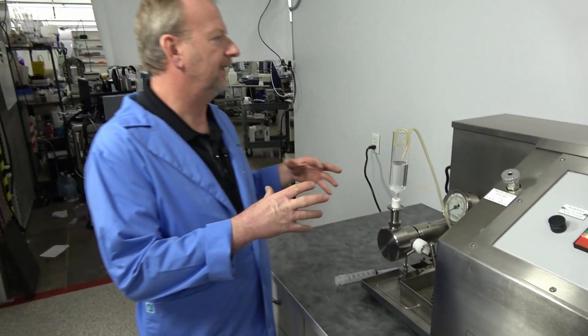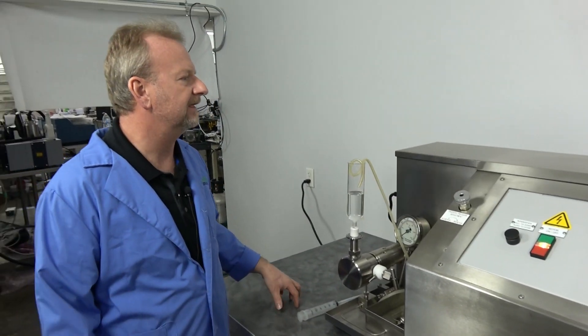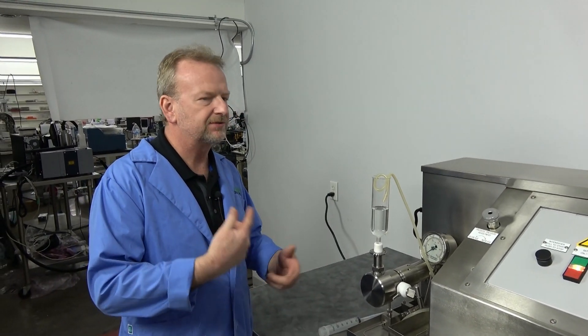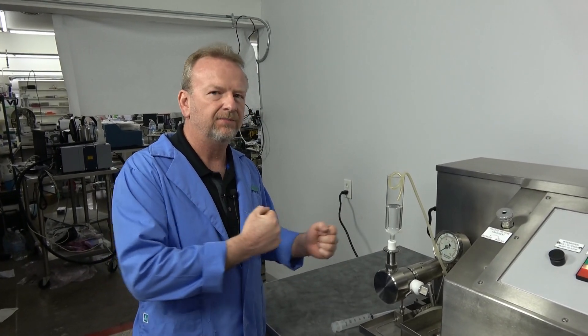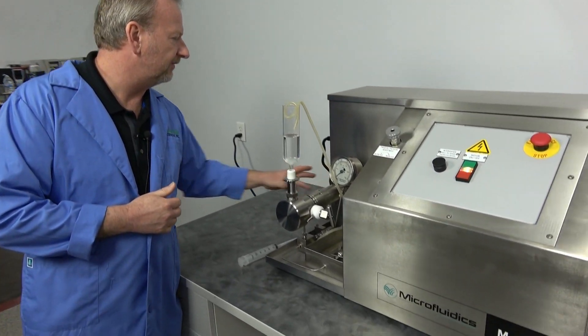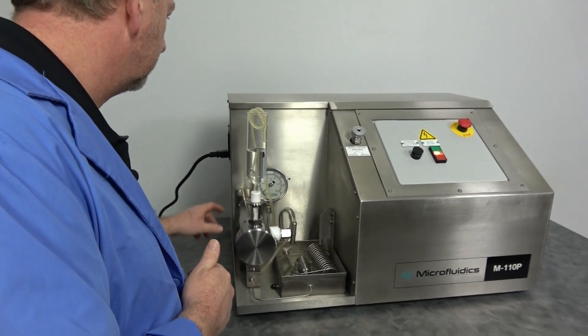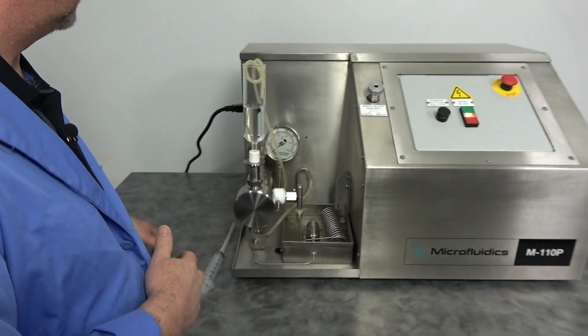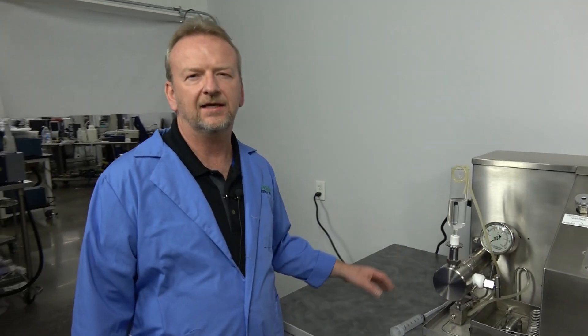This one has a hydraulic system built underneath the hood, where it's utilizing a motor which pumps hydraulic fluid into a pump that then utilizes a hydraulic piston — rather than an air piston — which moves the pump ram back and forth. It creates extremely high pressures, and you can eliminate the need for an air compressor that requires a lot of CFM, or burning through your laboratory bottles trying to run your air models.